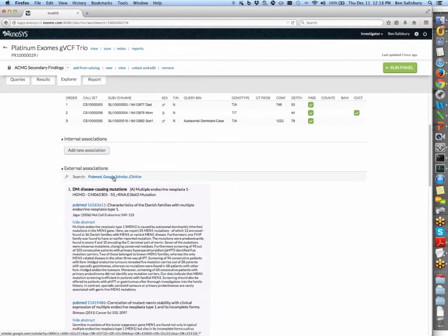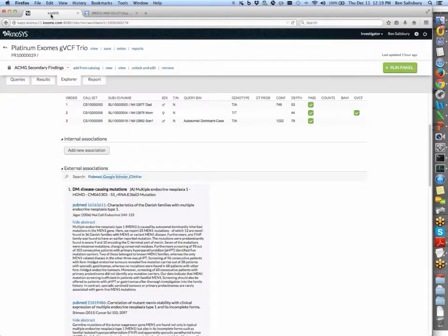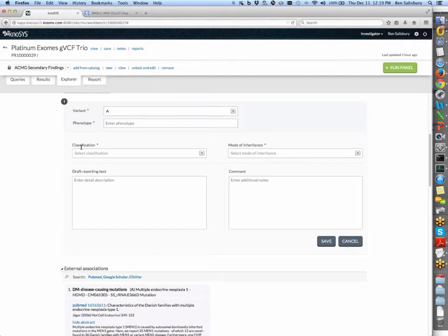If we wanted, we could go search out at PubMed or Google Scholar. If I click the Google Scholar link for the moment, in fact it finds 2 of those papers we were just looking at, and in addition to showing where that variant is in the paper, whether it's in the abstract or in the body, it finds an additional paper up here that wasn't listed, that's a review paper pulling in data from those others. Having reviewed all of that, you likely want to go retrieve some of those papers and look at them if you're really trying to make a final decision about this variant.